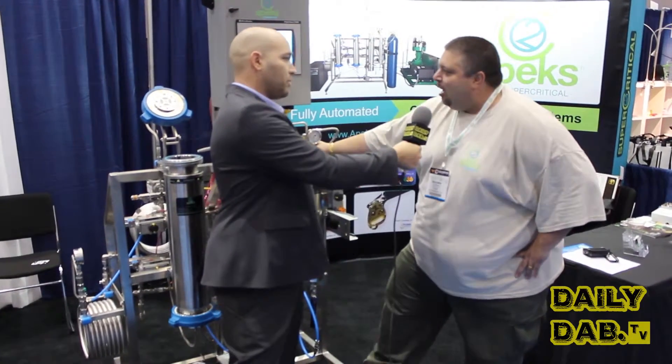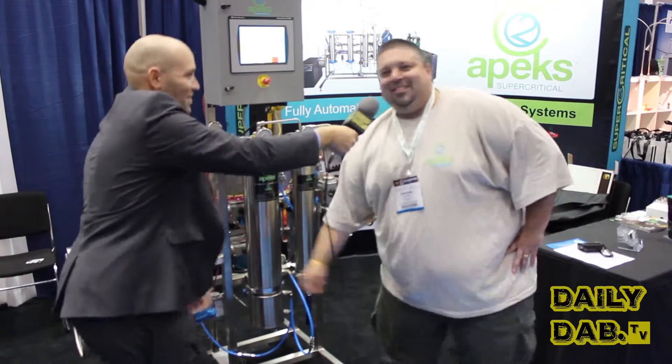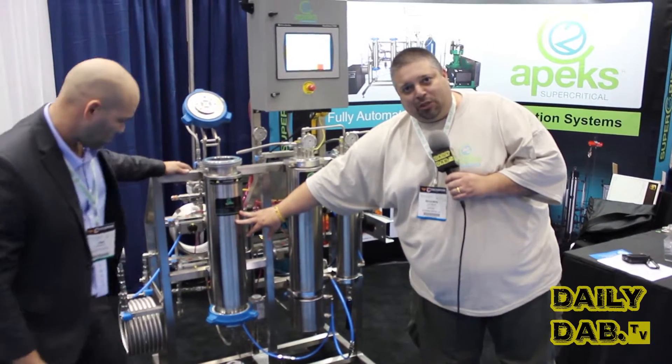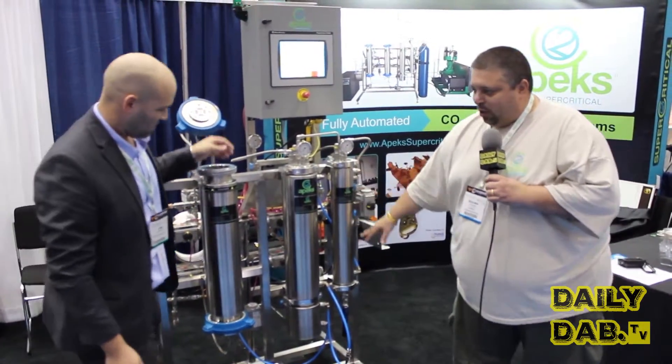Sean, tell us a little bit more about it. What we have here is our 2005 LD — fully automated system. This is your extractor side, holds up to 3 pounds of material on this side. This is our separator side, and this is the secondary separator side.